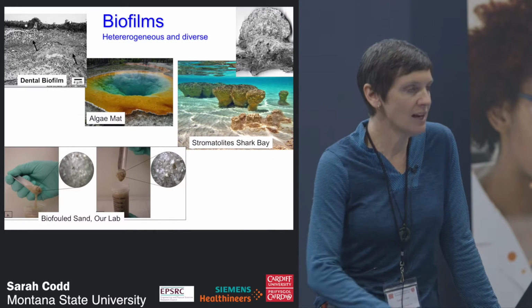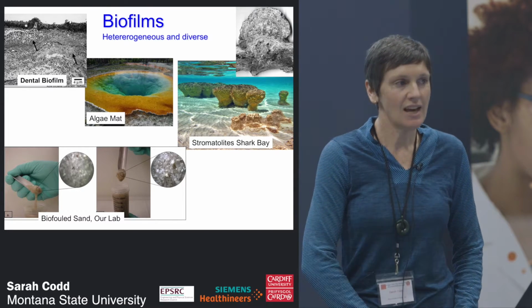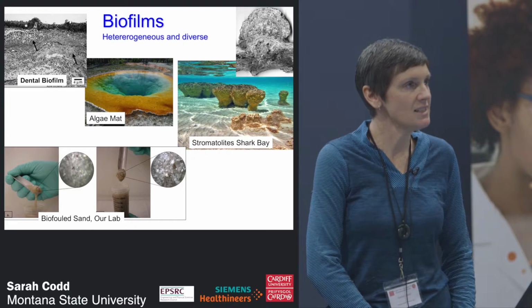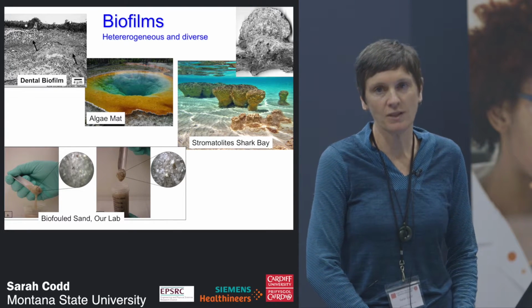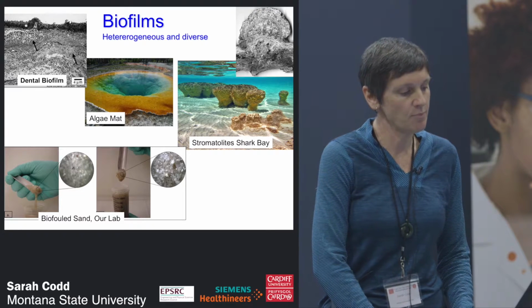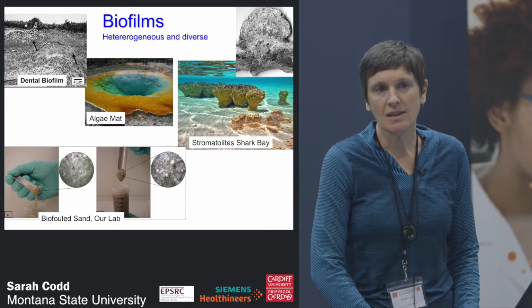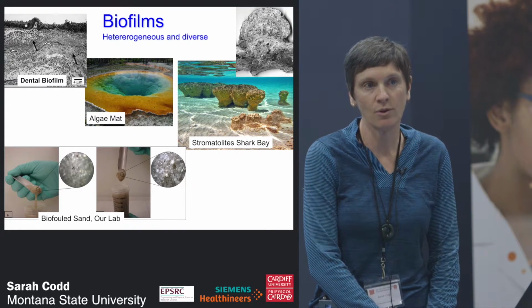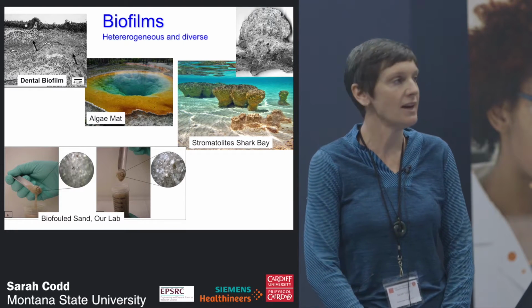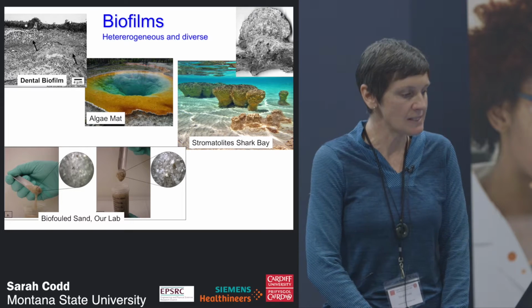So I want to now talk about the two applications. As I said, I learned about Q-space imaging, Q-space ideas with Paul Callaghan, and the propagator that you can get. And the propagator we looked at then was just simply water diffusing in a pipe. But since then, Joe and I have gone on to apply this same technique to a number of systems that are interesting to our collaborators and to industrial applications.